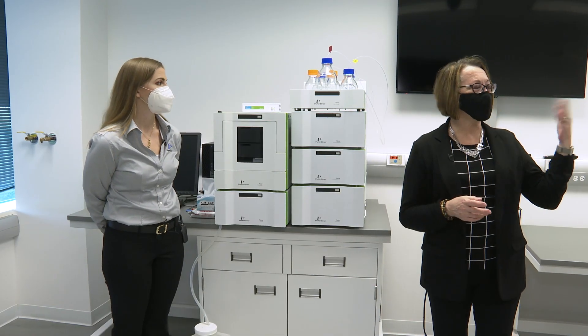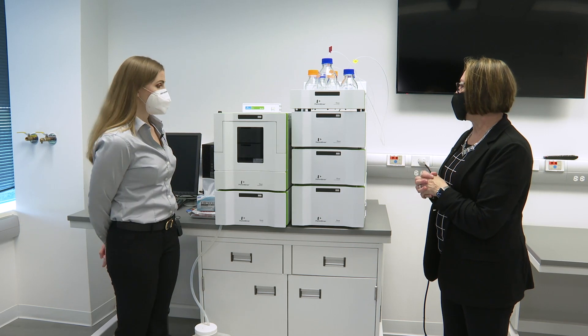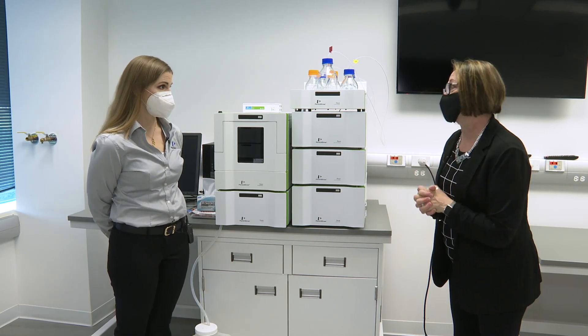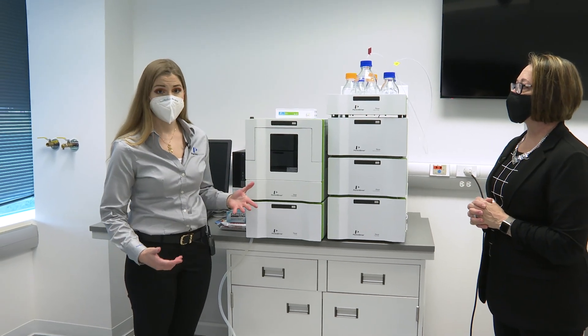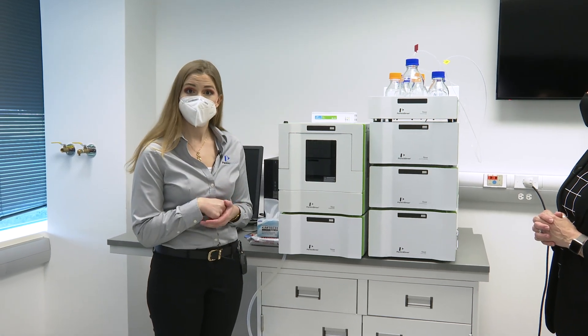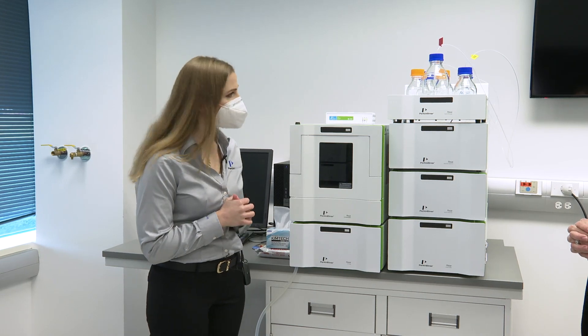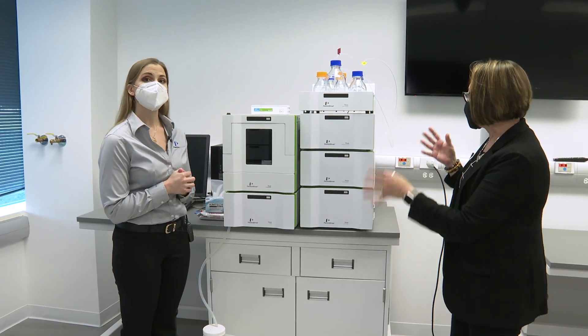We just walked across the hall and now we're going to talk a little bit about our LC. This is the Flexar HPLC — regular pressure HPLC. This one has our PDA plus detector on it, so you can detect anything that shows up in the UV. LCs have different detectors and things, and we've got some exciting news about a new LC that was just introduced to the field.